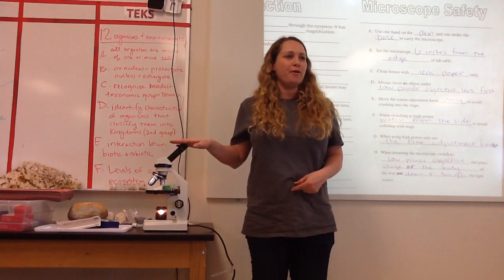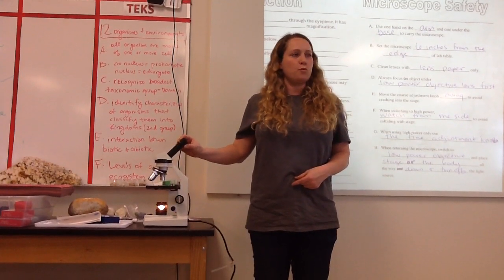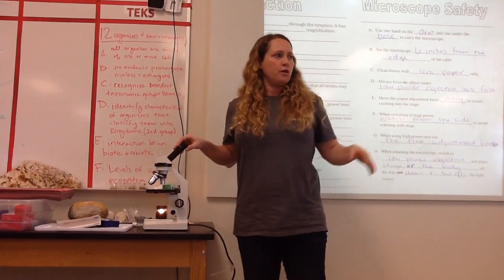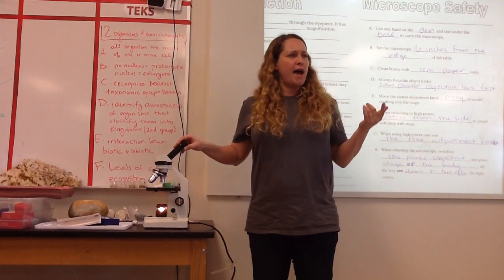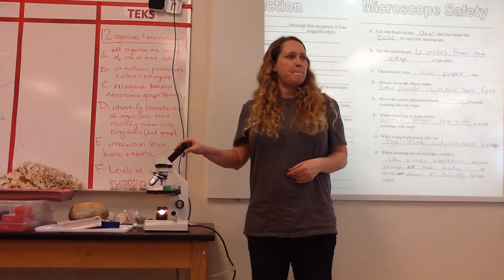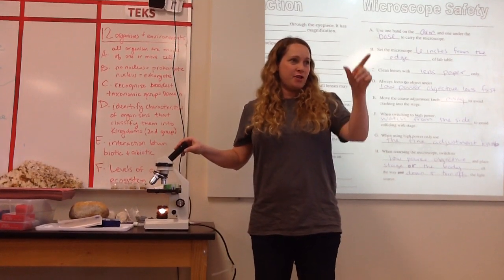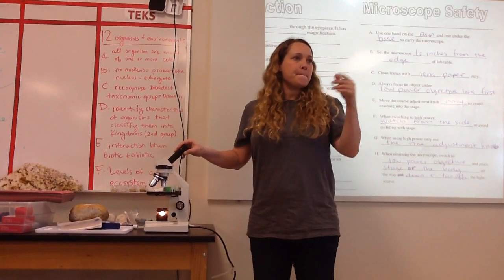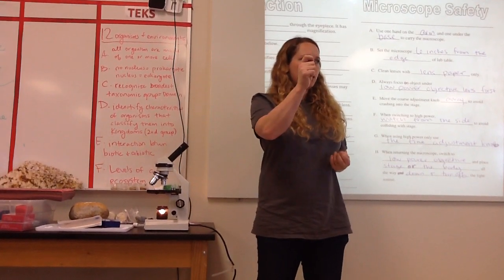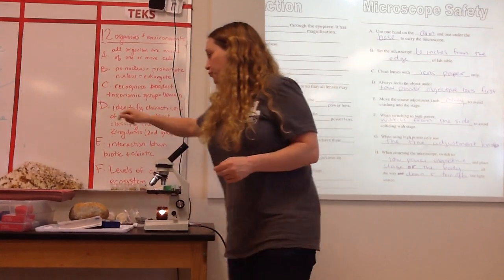Something you would already know about. Joshua, do you know? It kind of is an optical illusion. Why is it happening? Why, when I push right, would it go left in my picture? The glass? Something to do with the glass, Lauren? Maybe because it's magnified. It is about magnification. Jack? It's a mirror, so that it's opposite every time. It's kind of like, have you ever looked at yourself in a spoon? Mm-hmm. What do you look like in a spoon? Flat. And that's because the images flip.